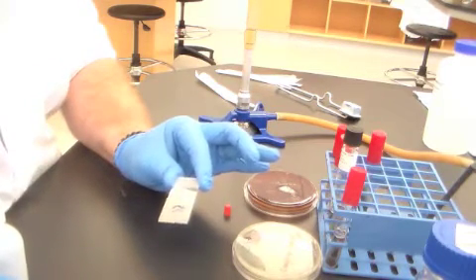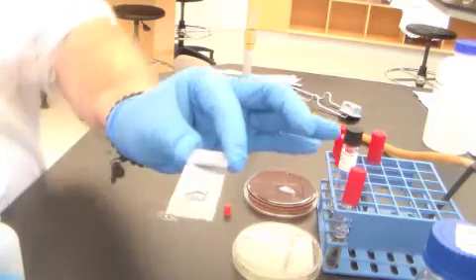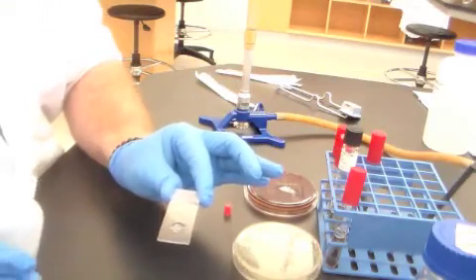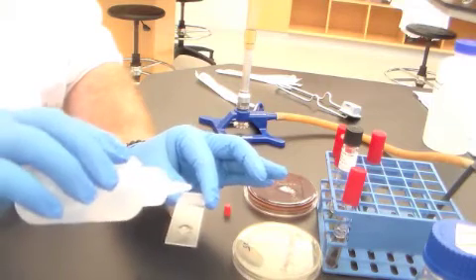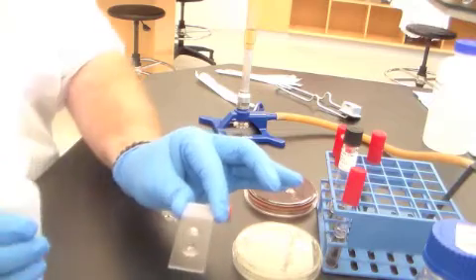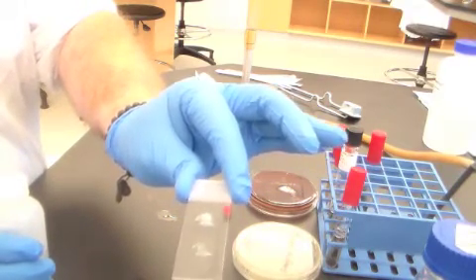What I'm looking for is a reaction. And since I haven't told you yet what the reaction is, it's not obvious to you whether there's a reaction or not. So to compare that, I'm going to put it on the Staphylococcus aureus. These are live cells, or at least they are until I put on this hydrogen peroxide. Can you see that reaction? There is very vigorous bubbling.